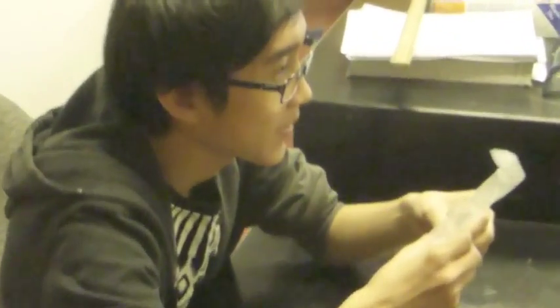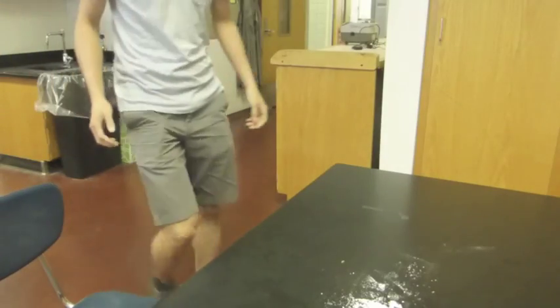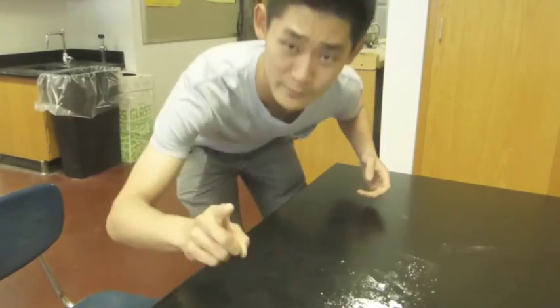Now this is what I'm talking about. Oh no, what is this mess? Always remember to clean up.